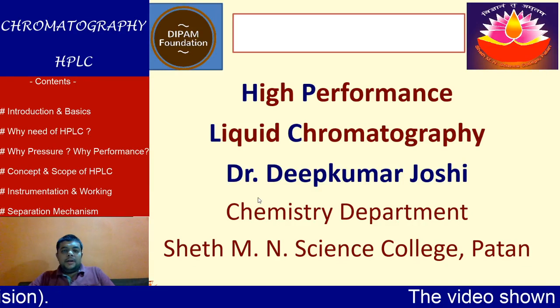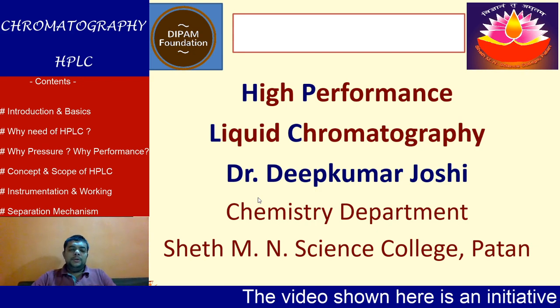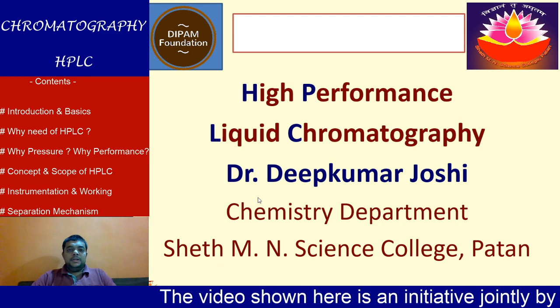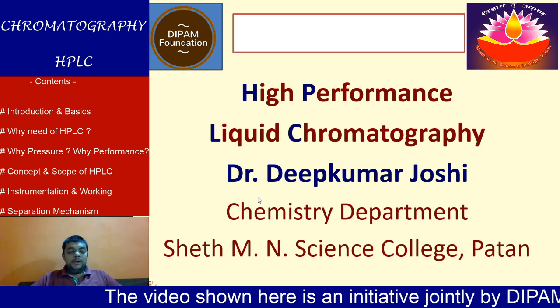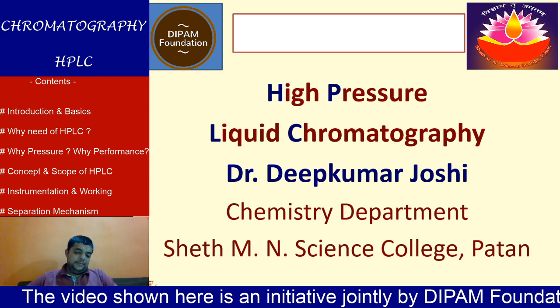So friends, this is in context to the two earlier published videos involving the basics of chromatography, TLC and paper chromatography. In this continuation of the earlier two videos, we are now going to discuss a very important tool in chemistry, especially an industrial tool, that is HPLC, which can be coined by two different names. You can either call it high performance liquid chromatography or you can coin it as high pressure liquid chromatography.